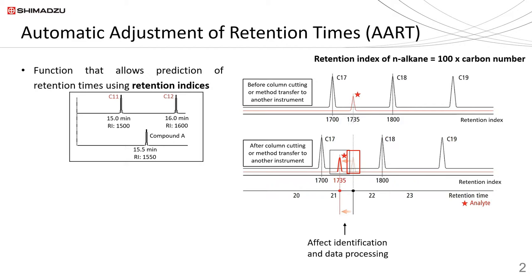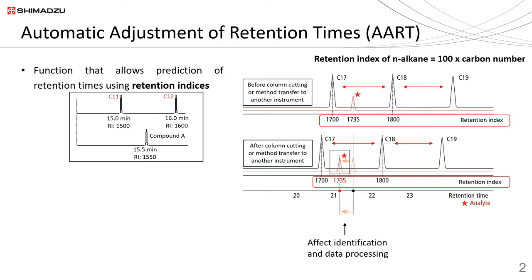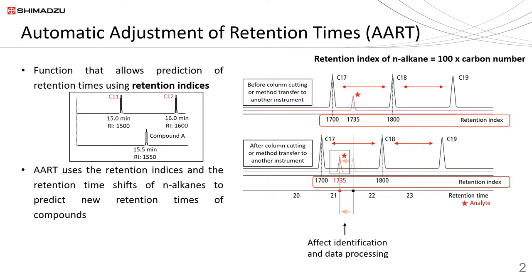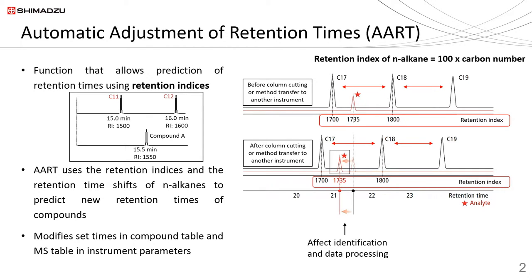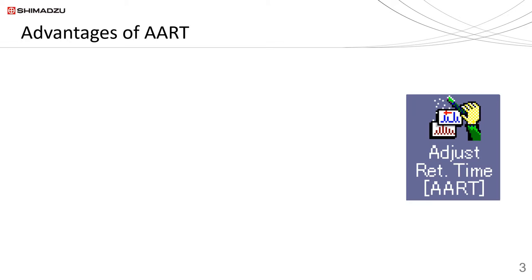Hence there is a need to modify the retention times. Although there is a shift in retention time when a column is cut or changed, the retention index and relative positions of the compounds remain unchanged when the same column stationary phase and dimensions are used. The AART function makes use of the retention indices and the shift in retention times of n-alkane standard to calculate the new retention times of target compounds, modifying the compound table and MS instrument parameters accordingly.